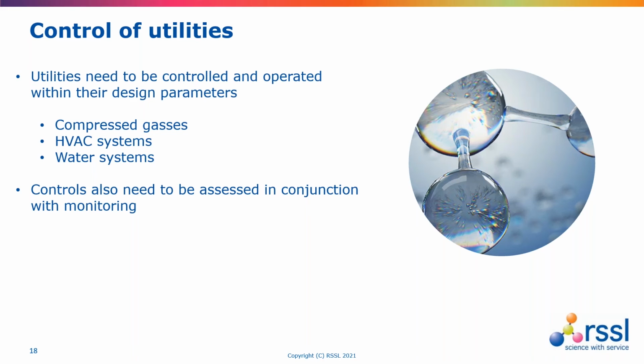And once we have solid controls, then we are able to also draw upon monitoring data. So if we take a microbiological example, if we have our, say, water for injection system in control, and we have it as, say, a hot self-sanitizing system at 85 degrees, then we can move on to consider what are the appropriate sampling frequencies and at what times of the day, which becomes quite an important question for a 24-hour facility, should that water system be monitored.